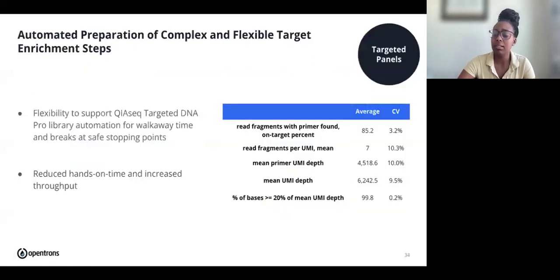And then just to cover some very complex workflows, there's some targeted sequencing that we've done here, showing a lung panel that we worked on. The complexity of these workflows is really notable here because they are long and we need to run them consistently, and they're with very precious samples, as they all are, but a really particular sample type as well.